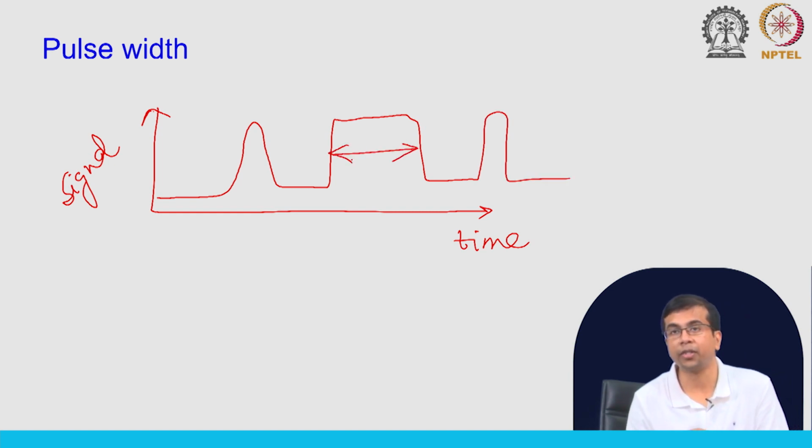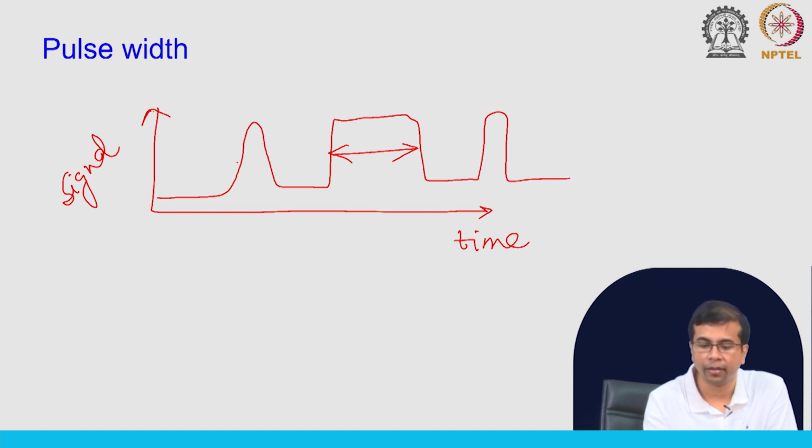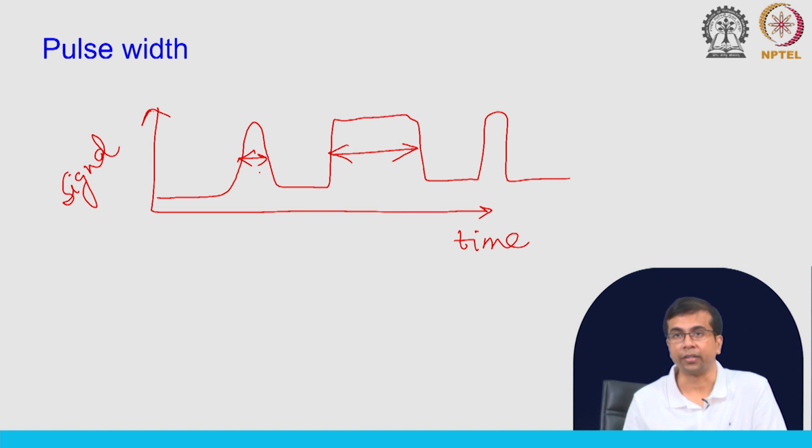If you look at the real data, you will observe these pulses of different widths. And again the question is why is this important? I will tell you that this kind of signal can be combined with interpulse duration, and it can help us understand the modifications on DNA better.